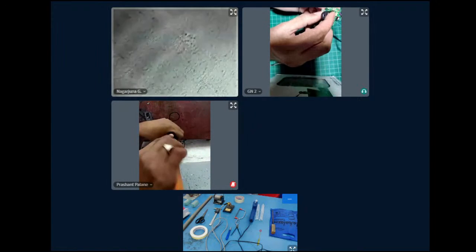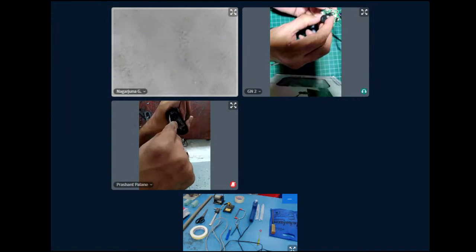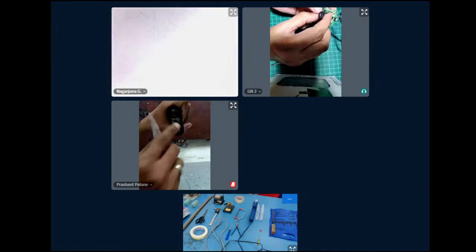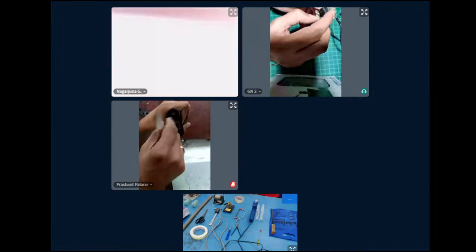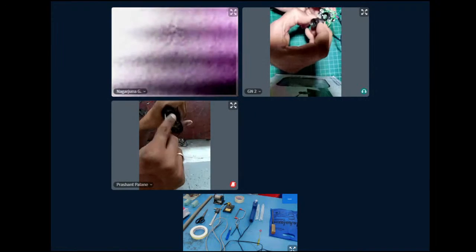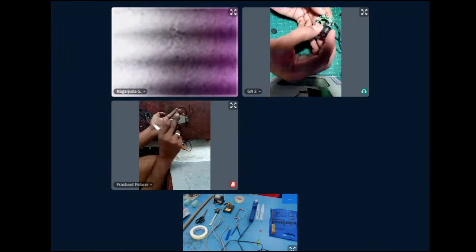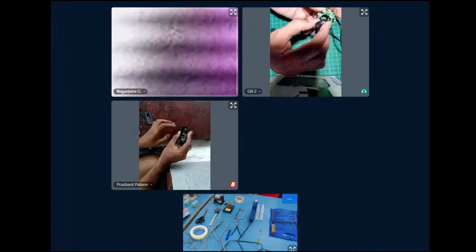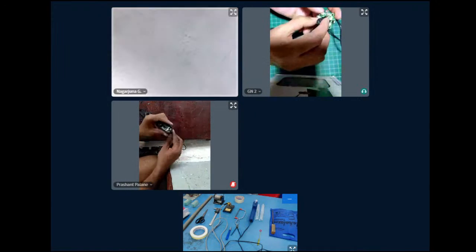Okay, so there are, of course, a lot of finer things that you have to do. This is basically the minimum that you need to do, but now comes some more complicated stuff. After doing this, different cameras have different ways of attaching it.